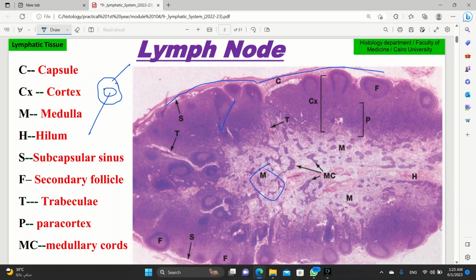Great. So the dark part is basically the cortex, and the light part that is in the middle, that's the medulla. Always remember medulla, middle. That's easy. So actually, that's the meaning of medulla. That is on the inner side. So basically, that's the capsule, the outer part.